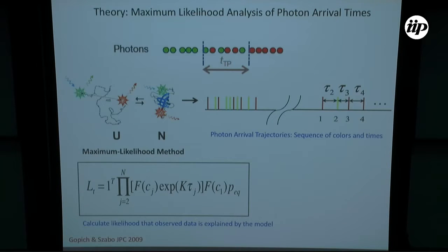Okay. So now, rather than binning, which means you take all these photons together and you separate them by green and red, and you calculate the FRET, what you can do is say, because the number of photons that I'm going to get to see is not enough for the processes that I'm interested in, like folding transition paths, which may take a few microseconds, so it's going to take only a few photons to see.